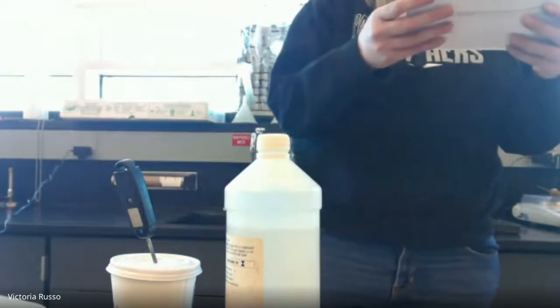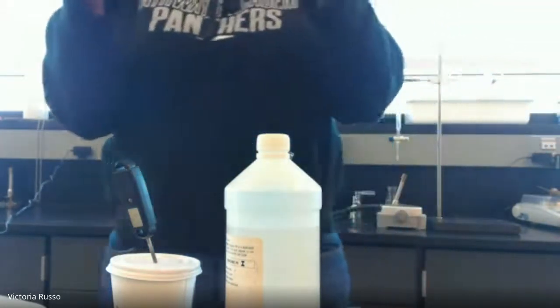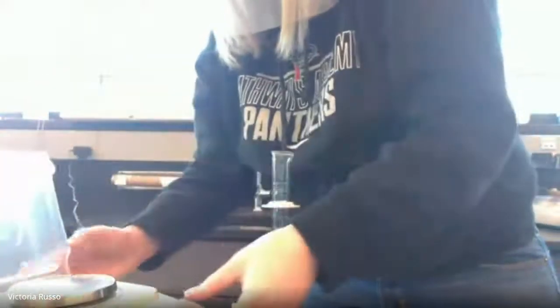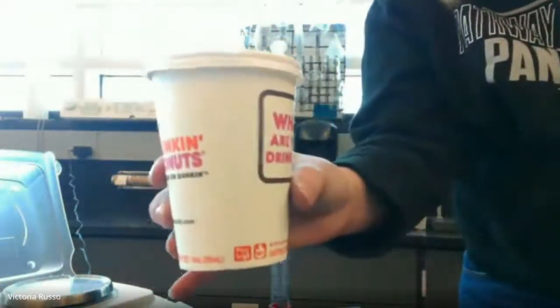Using an electronic balance, weigh your empty dry calorimeter, which is a coffee cup. So I am going to turn on my scale here. Let me move my hydrochloric acid and stuff out of the way. You can see the scale. Here is our scale. I'm going to turn on the scale. This is the one that is very sensitive, so we can't breathe. And I'm going to put my calorimeter, which, if you look, is literally a Dunkin' Donuts coffee cup.